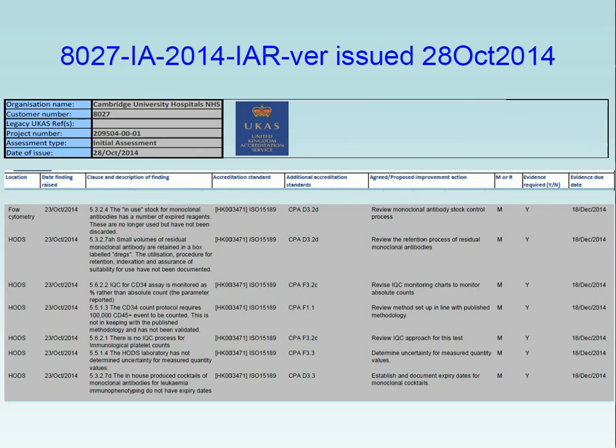And we didn't have a stated process of regularly monitoring whether those reagents were in date or out of date. Now, clearly the ones that you use constantly, and we churn through those at a massive rate, they're always in date. Most antibodies have at least a year or 18 months expiry on them, so it was not a problem to us. However, on the right, you'll see that there are some hidden boxes, and your inspector will delve through all of those. And that was our problem.